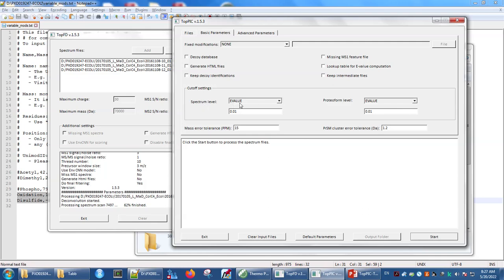And as a result, we can use an e-value of 0.01 to say this is a score for this spectrum that would only have produced a match this good in random sequences 1% or less of the time. And we can perform that filtering not just on the proteoform spectrum match level, but also on the proteoform level. We may certainly collect many spectra for a given proteoform, so we can filter those on this e-value property as well.